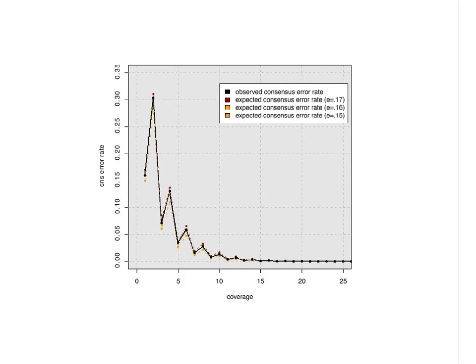I've got one. May I nominate a question quick, Kevin? You may, quickly, yes. Anne had posed a question to me that I'd like to address. She has a single-cell sequencing project. She has some DNA. She's wondering, due to the bias of multiple displacement amplification, would you recommend using HiSeq or PacBio CCS for the sequencing?